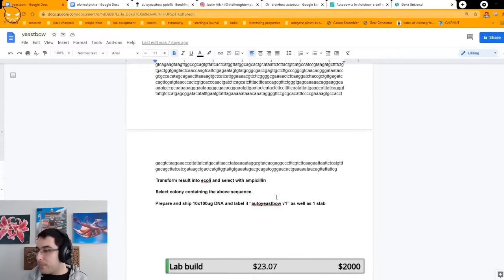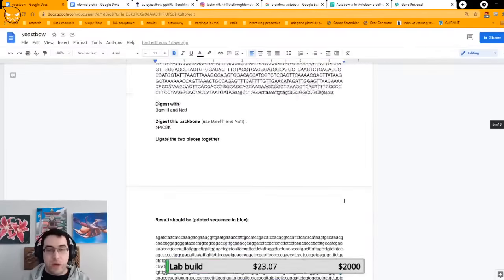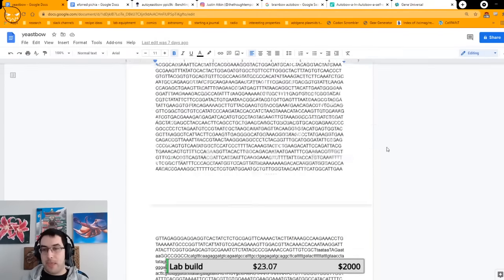All ready to go. So with that, this file is essentially ready to be sent off to the company. And you send them an email and say, hi, I'd like you to make this. You make an account first, you contact the rep or whatever. But this is now ready to be sent off to them.